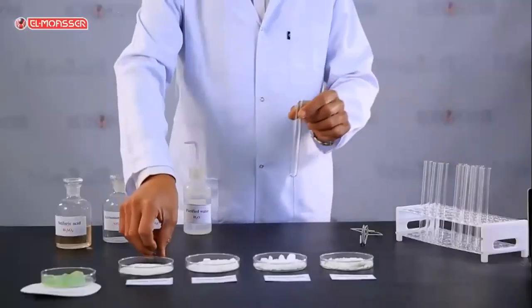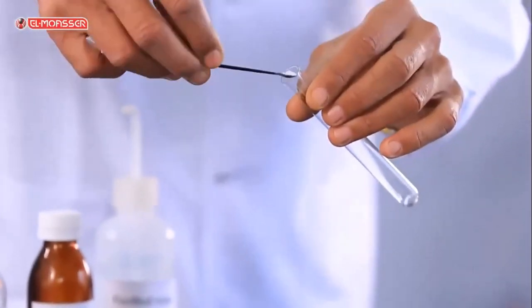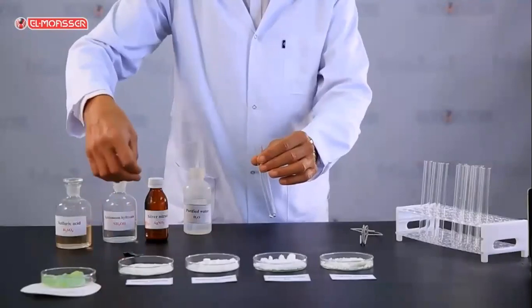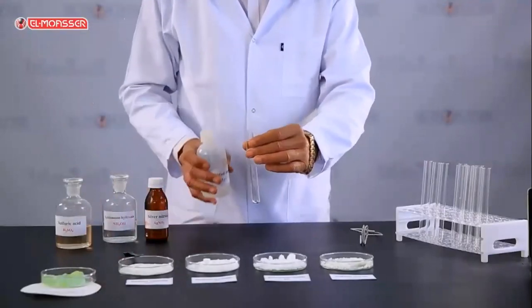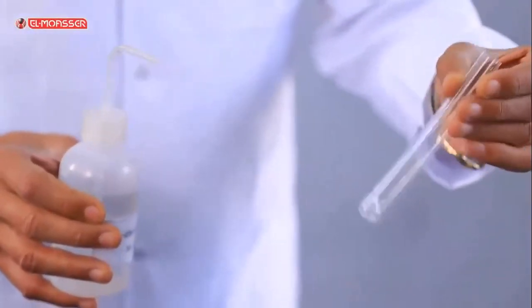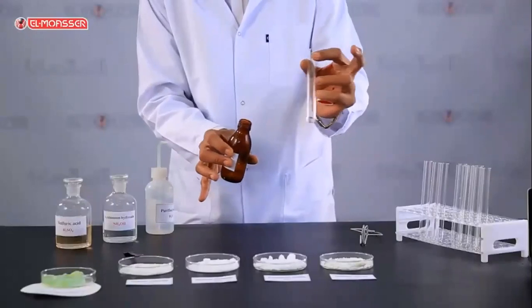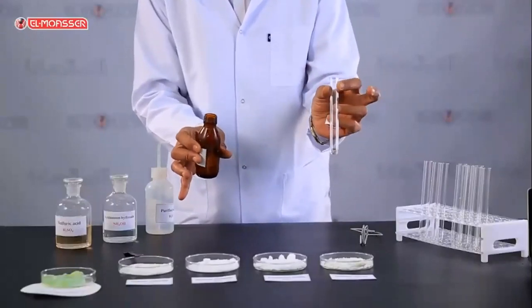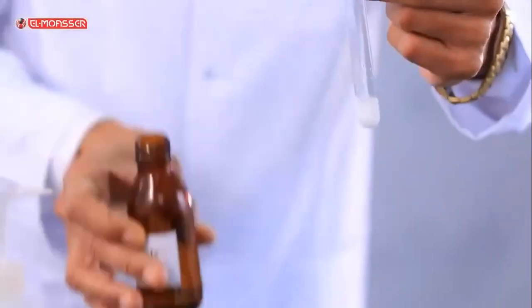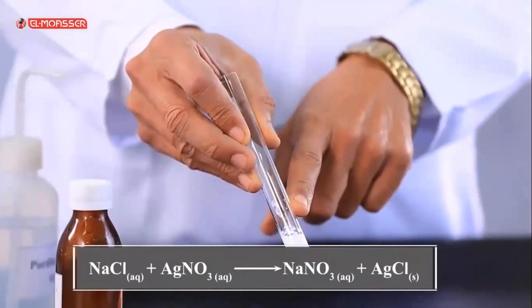Confirmatory experiment. Add a small amount of sodium chloride salt to a clean test tube, then add distilled water with shaking to form a salt solution. Then add to it silver nitrate solution. What do you observe? A white precipitate of silver chloride is formed.